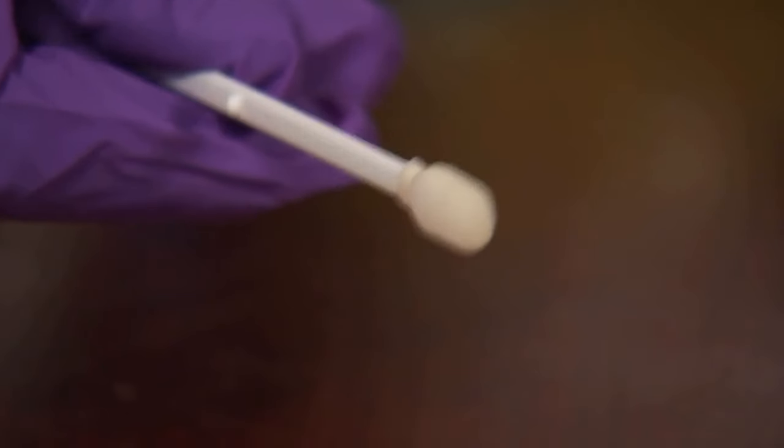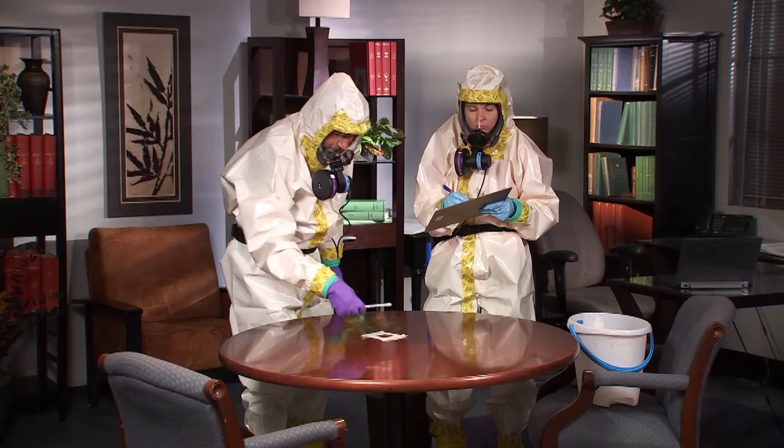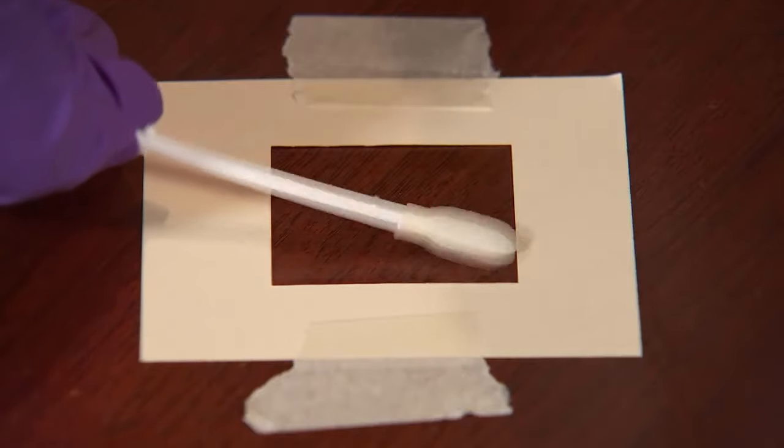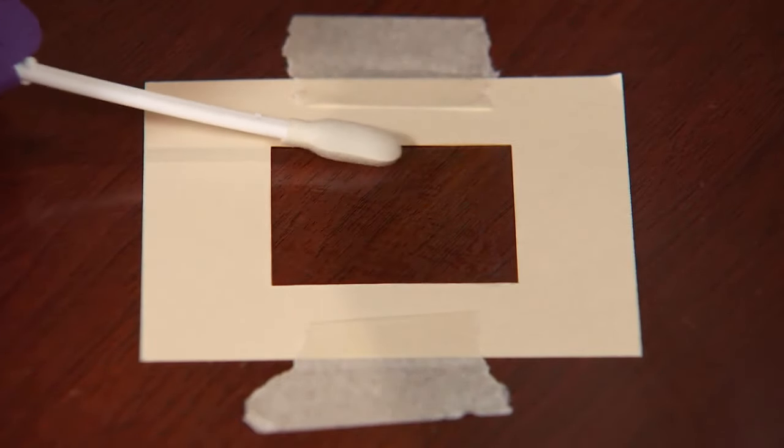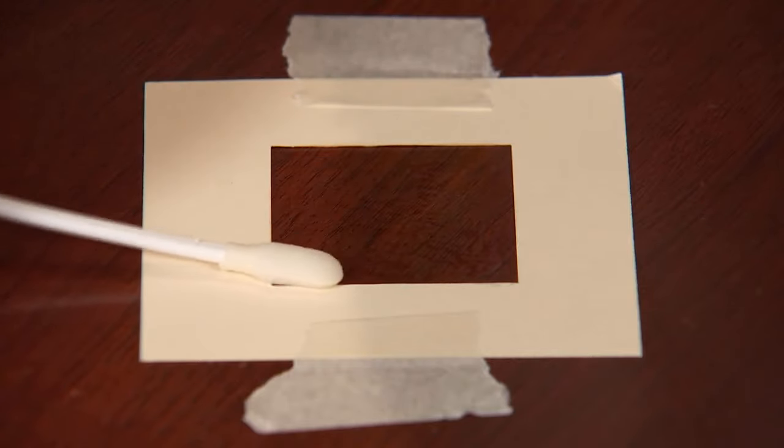In the second pass, the sampler rotates the swab to a clean side, places the side of the swab on the surface, and covers the area with vertical S strokes. These strokes will be at a 45 degree angle to the first ones.